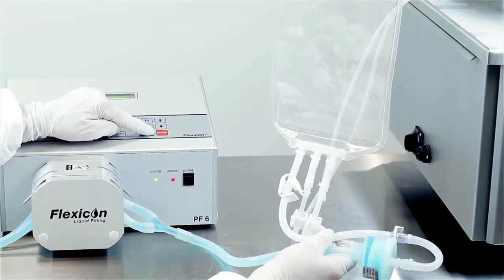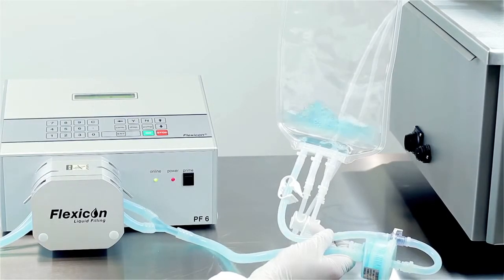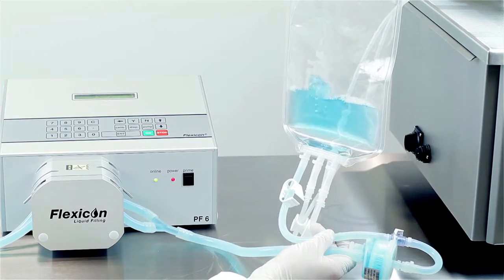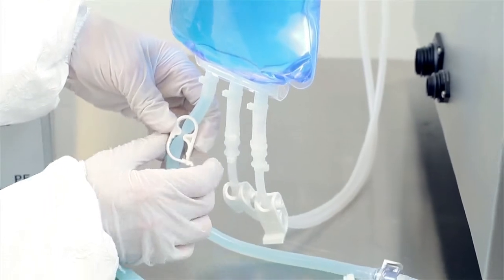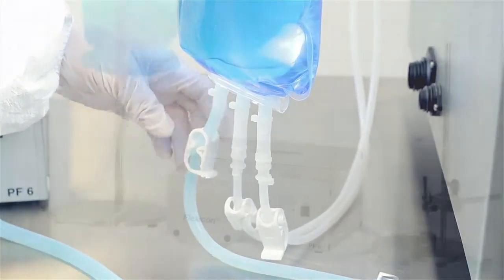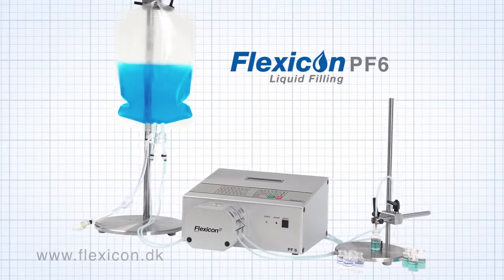The PF6 has been optimized to work with AccuSyl Platinum cured silicone tubing. This type of tubing delivers accurate dispensing and is an important part of the total filling solution, ensuring that costly overfilling is prevented.